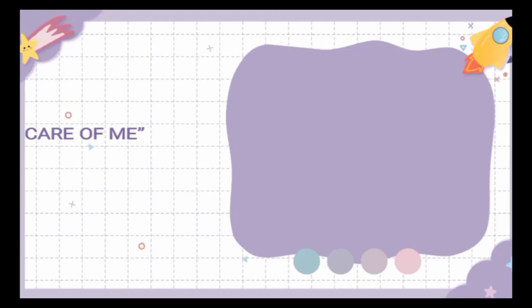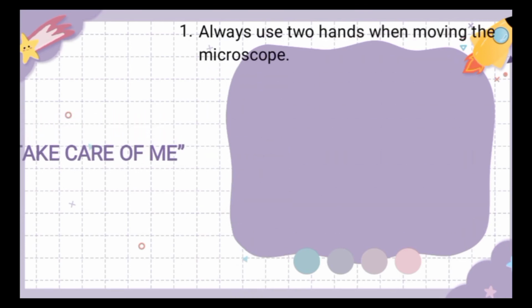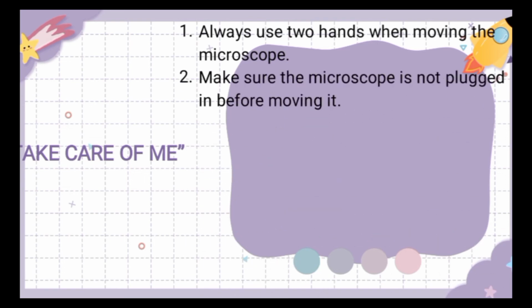Taking care of the microscope, class? Very good. So these are the tips on how to properly care for the microscope. Number 1, always use two hands when moving the microscope. Number 2, make sure the microscope is not plugged in before moving it. This is only applicable for the electric microscope.